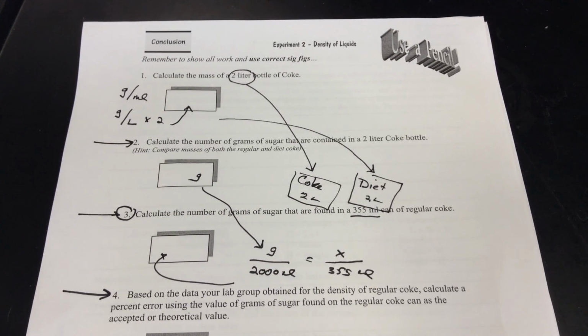In the conclusion, all you're going to do is tell me what you found for the 3 liquids, their densities, the grams of sugar you found, and then the percent error. And then in the second part of the conclusion, very simply, just list the errors, and there's a bunch of them along the way, along with what's wrong with the major premise, and you're done with the lab.